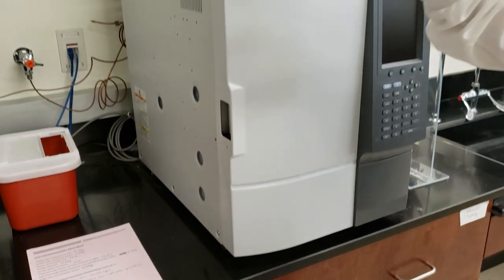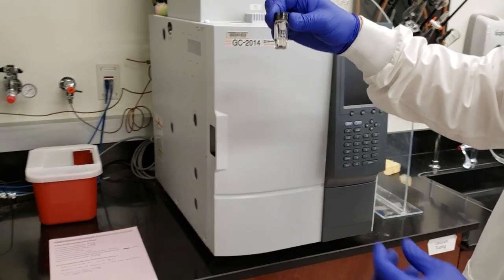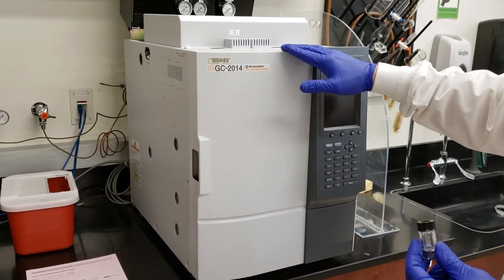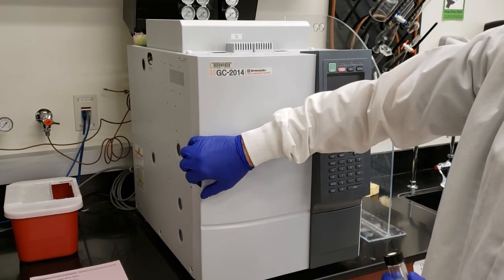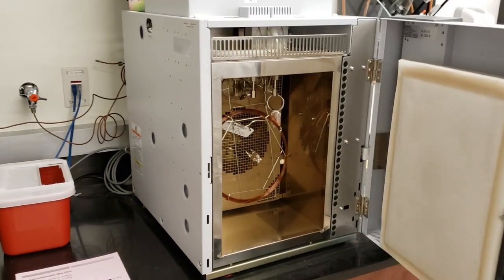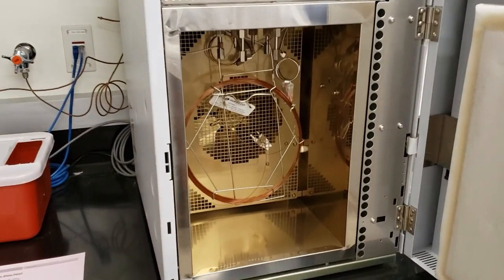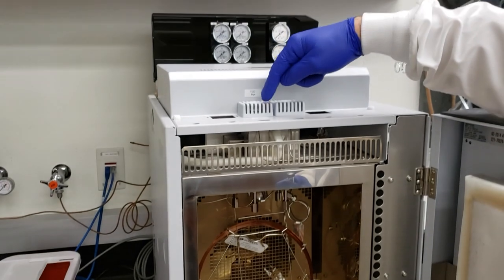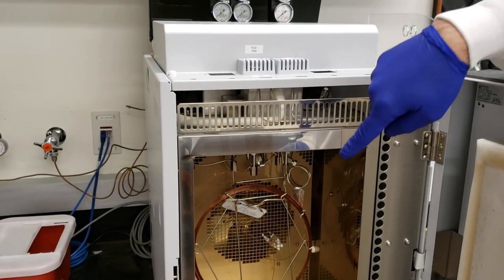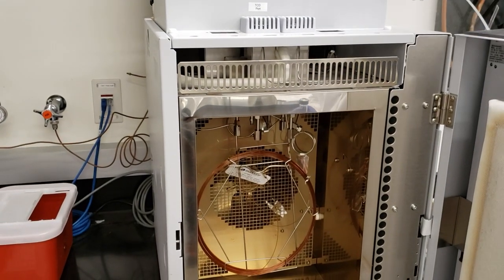Now we have our final product here. We're in our capped 3 mL vial. We're standing in front of our GC unit. We've got a GC 2014 from Shimadzu. We have our oven cavity here, which has our column. We're going to be injecting the sample into our TCD port. It will be pushed through the column to our detector.